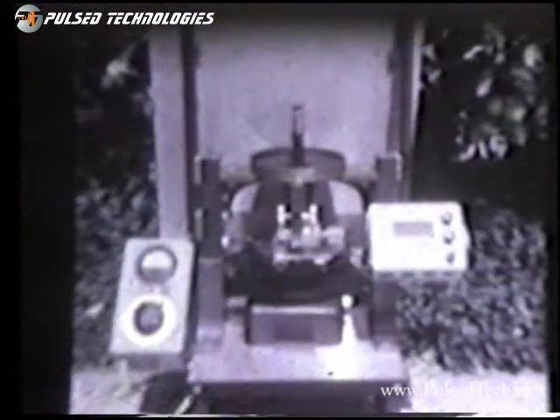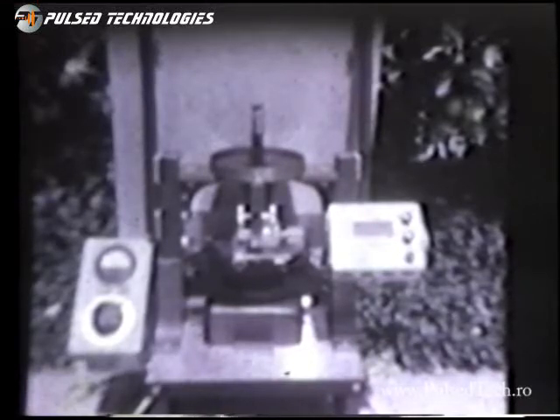Here we go. Okay. This shows the projection microscope with a test lens in the center of it, which can see the filament of the light and bring the entire system into focus for projection to a screen 10 foot away.